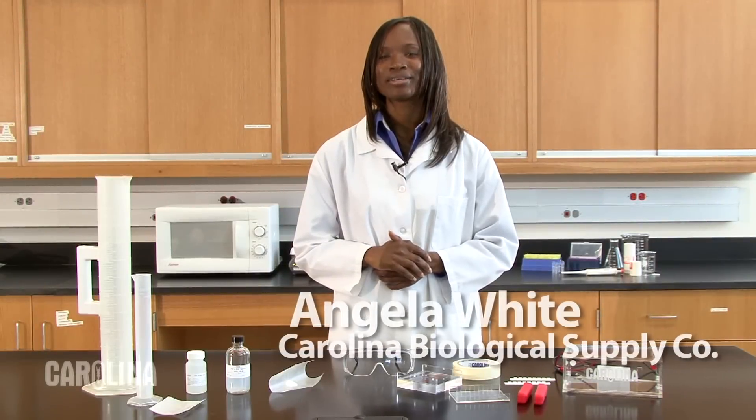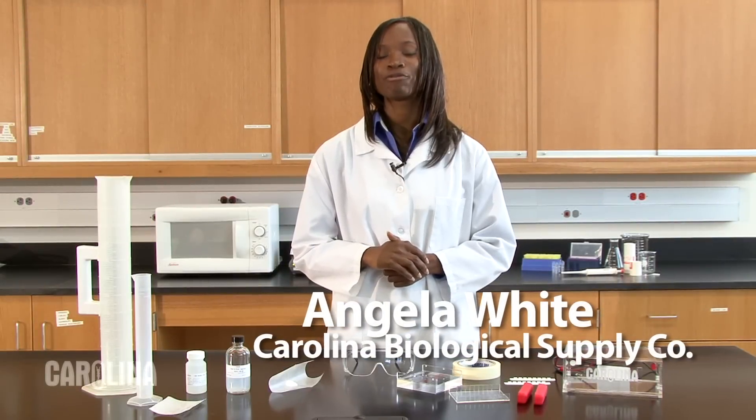Hi, I'm Angela White, biologist, product developer, and former high school biology teacher at Carolina Biological Supply Company. Today I'm going to demonstrate how to pour an agarose gel for electrophoresis.